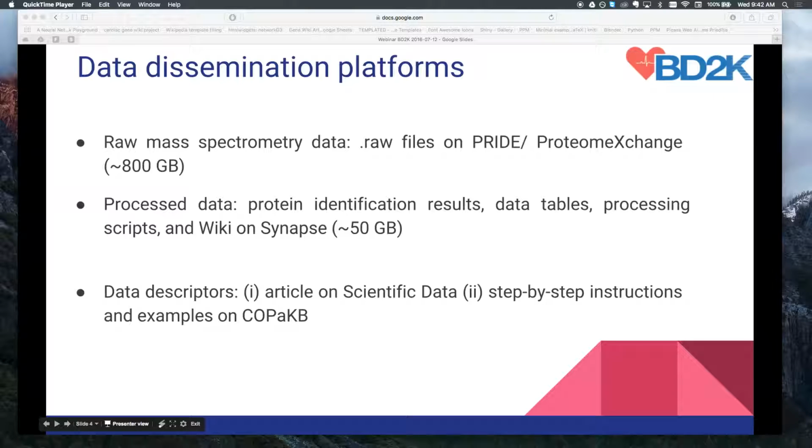The challenge in sharing a big proteomics dataset is that a proteomics project may generate many different types of files, including raw mass spectra, identification results, quantification results, and other processed files. The spectral files are rather complex and not just linear sequence information, so the many types of files may not necessarily fit in a single repository, which might be optimized only for holding a certain type of files and data. So we have to devise a clear system as to where and which platforms the different types of files should go.